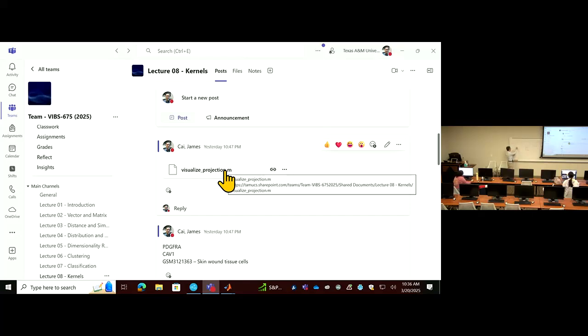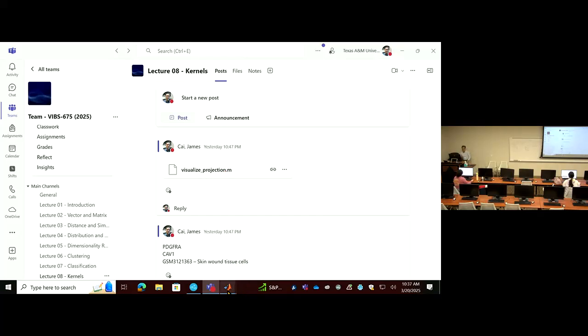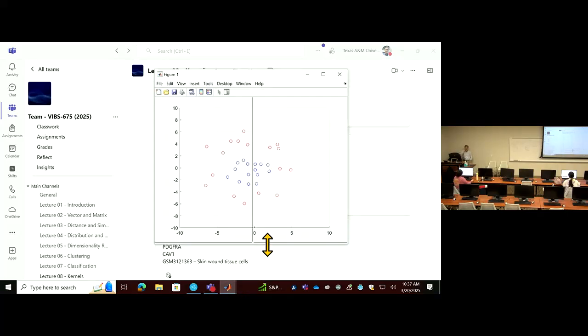It will make it 3D and make these points separable in the higher dimension once you finish this Gaussian kernel transformation. Right click, it's hard to operate. So you just click to draw these red points, then right click to stop.